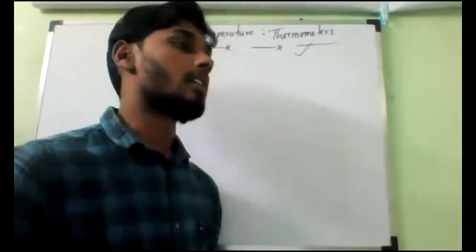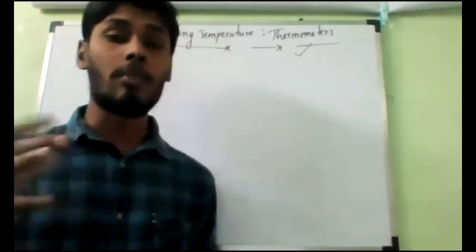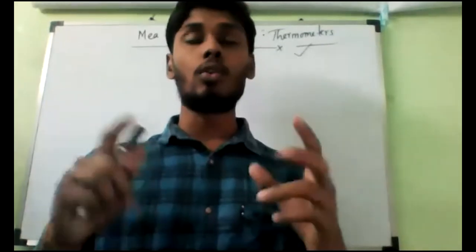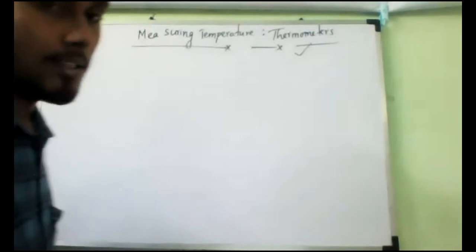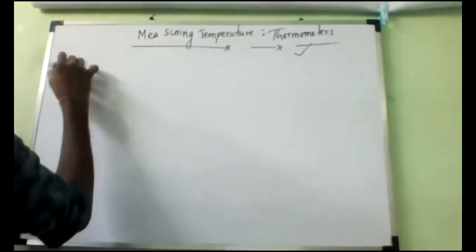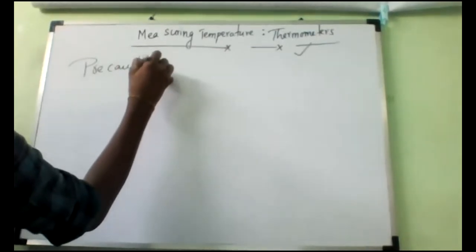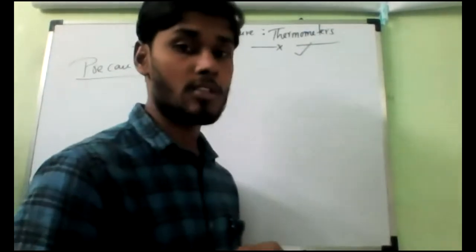Now, can everybody handle it? Suppose I give one to Mari, one to Kaushik, one to Hari. Can everybody use it to measure? No. If you want to use this laboratory thermometer, we must follow some precautions. Why? Because it is made up of a glass tube. That is what you should remember first.